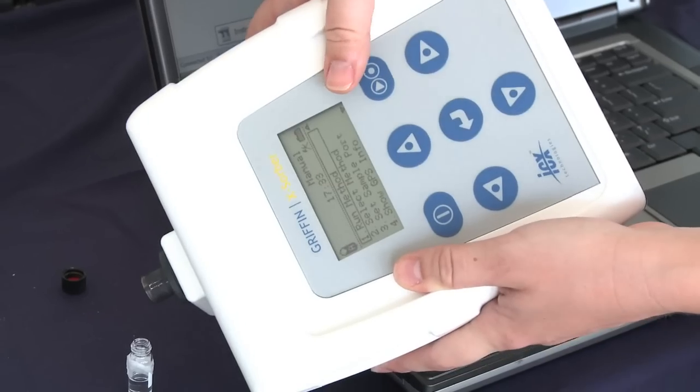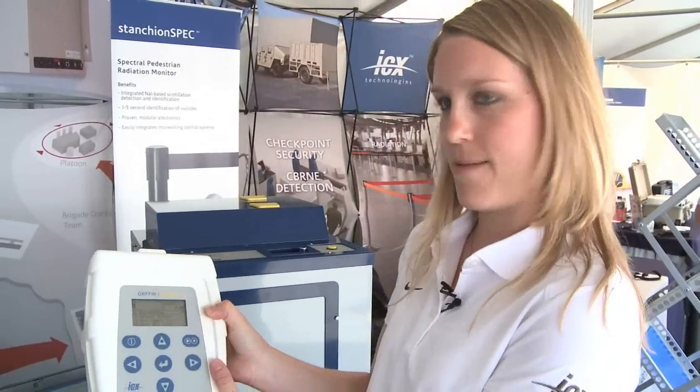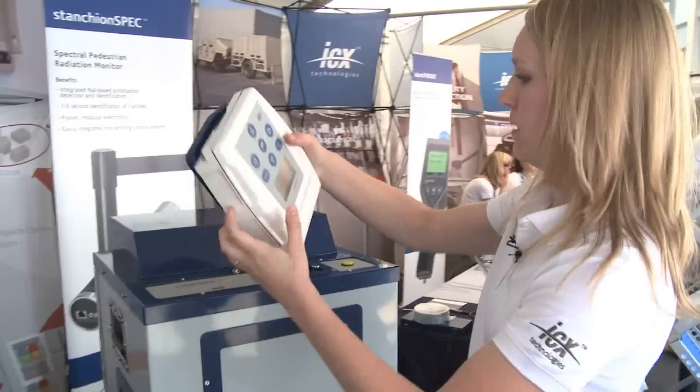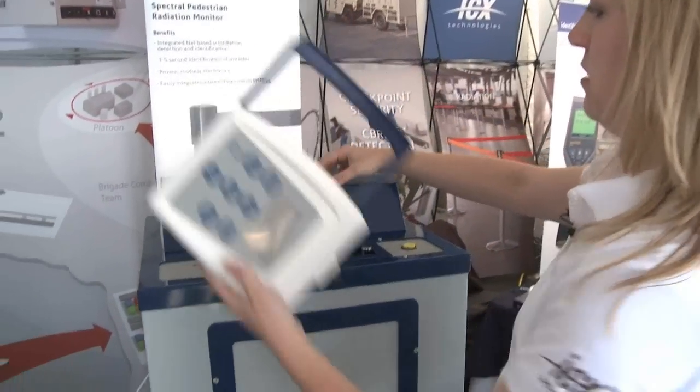Now we're going to take the Xorber over to the mobile GCMS and analyze the sample. To do that, you open the handle for balance, open up the sampling port on the Griffin 450, and insert the device.